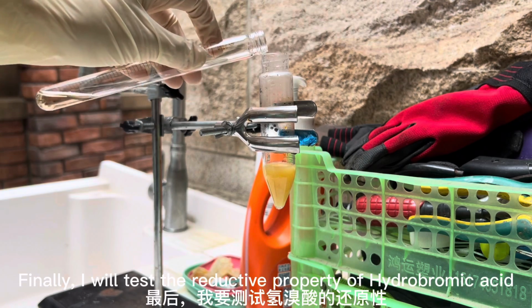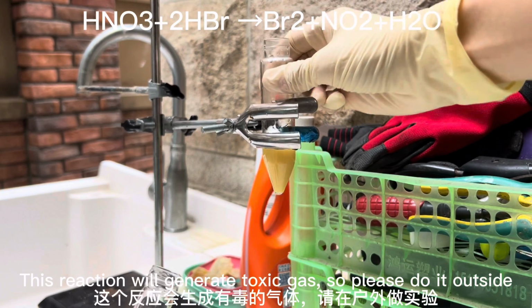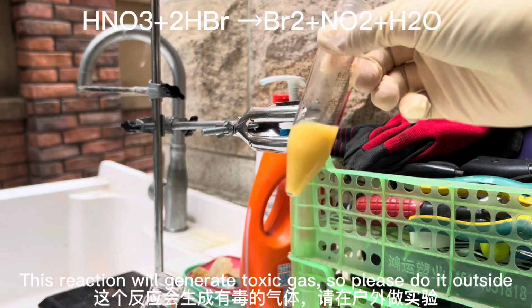Finally, I will test the reducing property of hydrobromic acid. I pour some hydrobromic acid into nitric acid. This reaction will generate toxic gas, so please do it outside.